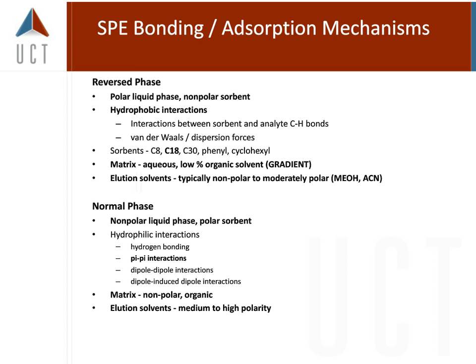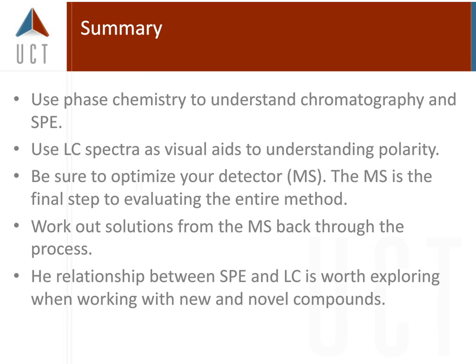You put it on all at once, you take it off all at once. But in liquid chromatography, we put everything on, and then we slowly change that gradient. And I think that's where understanding your wash solvents and polarity and the different solvents that you choose, not only for your extraction, but also for your mobile phase, are important. And essentially, in summary, what I tried to do is, again, reverse engineer, understand and make sure my instrument parameters, the solvents that I've chosen for my gradients are the best solvents.